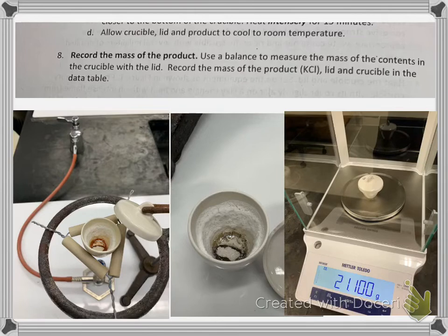And so you can see here on this picture, I looked inside of it. There wasn't bubbling. It still had a little pink there because the crucible was hot. And then here I took a picture once it was cooled. So this first picture is when the product is still hot. And then finally on step 8, I took the cooled crucible and measured its mass.